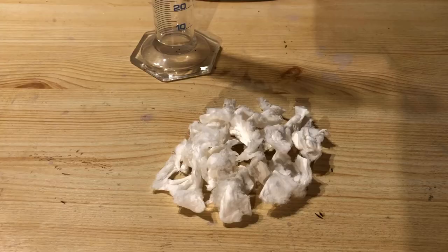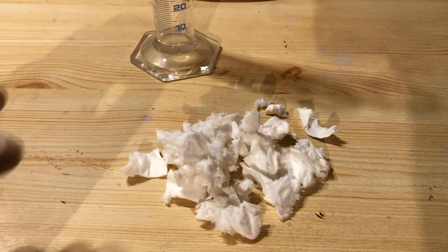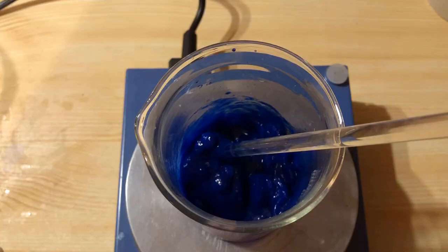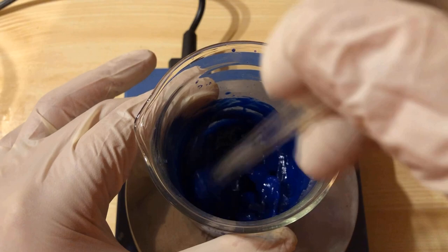Meanwhile, some cellulose is plucked. I use medical swabs that are made of 100% cellulose. The cellulose is then added to the solution. A thick slurry is formed, which is stirred with a glass rod until a homogeneous mass is obtained.